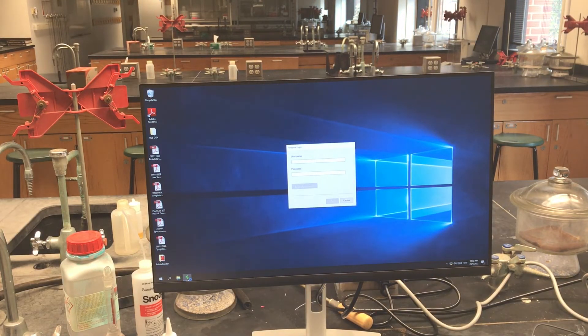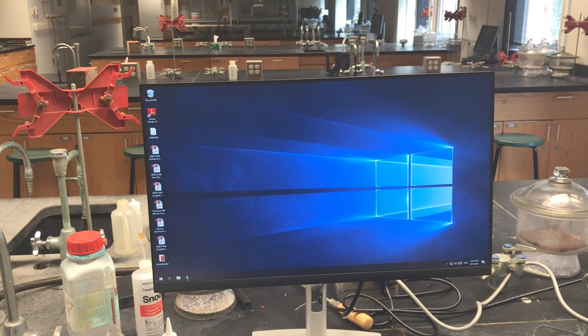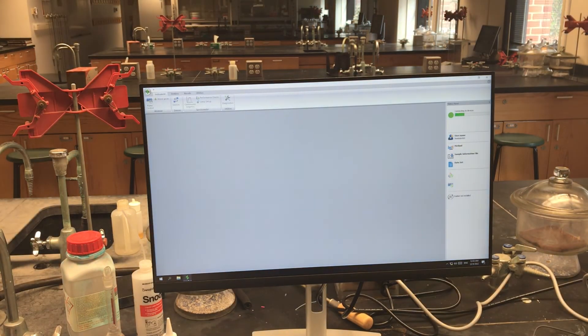It's going to ask for a username and password. You'll notice that the software is connecting to devices. It's connected to the spectrometer.